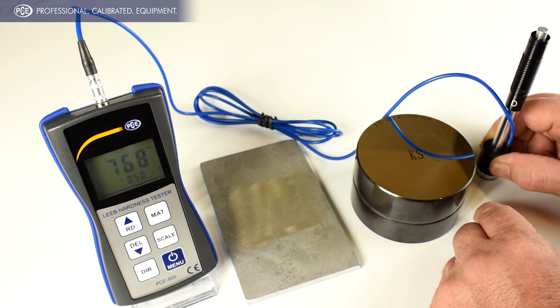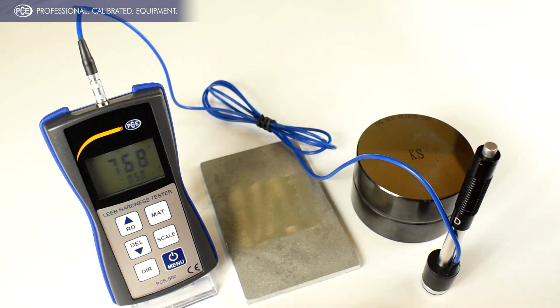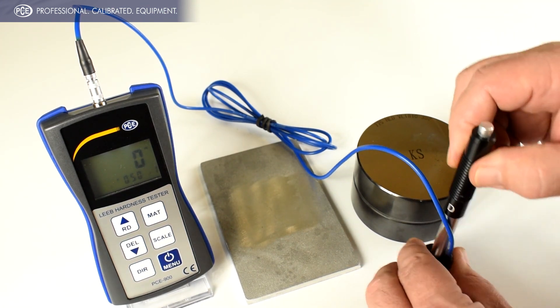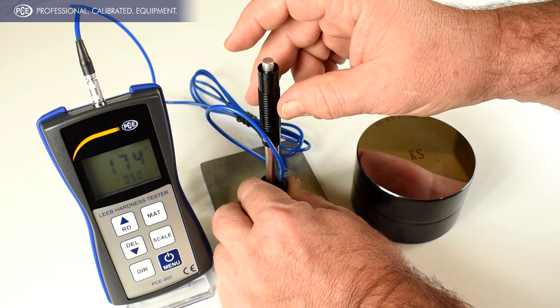So now we'll measure this piece of aluminum, but first let me take it out of CAL mode, simply pushing that button. 174.